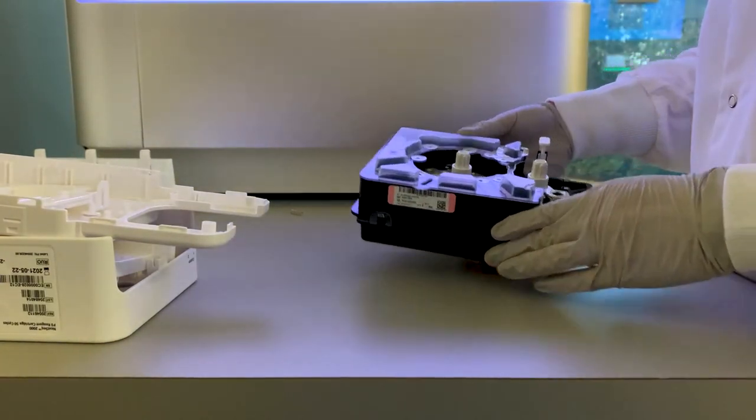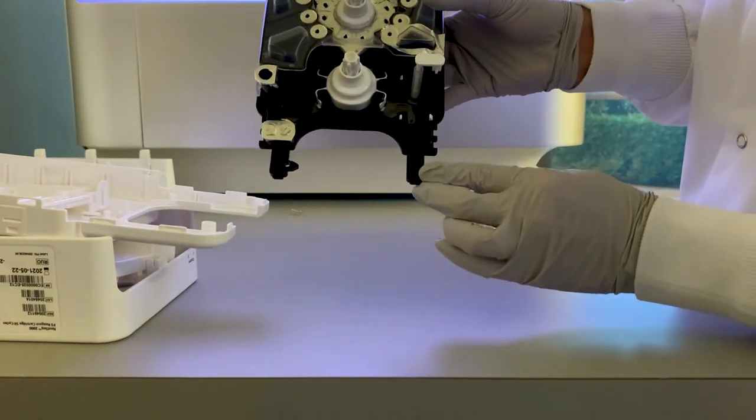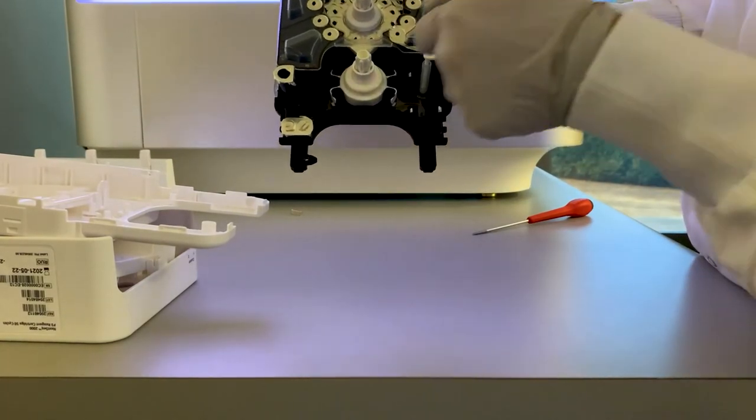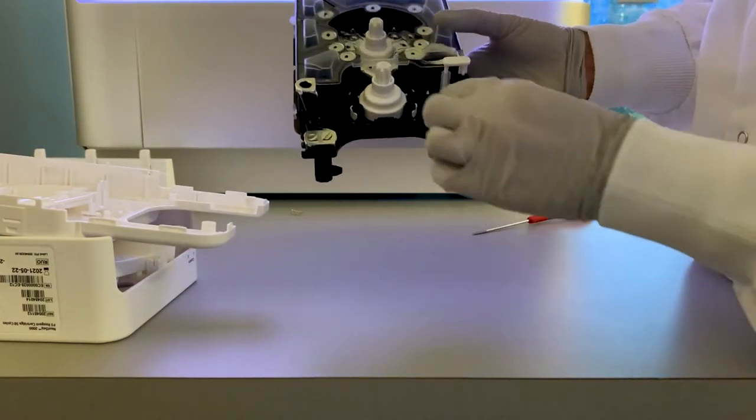Disconnect the four snaps on the valve assembly by pushing the snaps down and away from the reagent well plate edge. Remove the valve assembly by pulling the underside of the assembly.